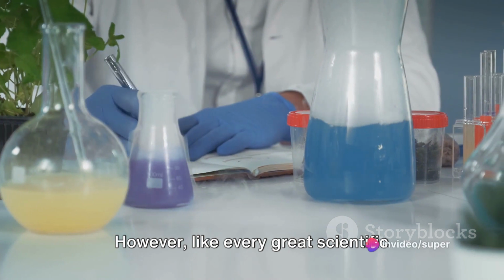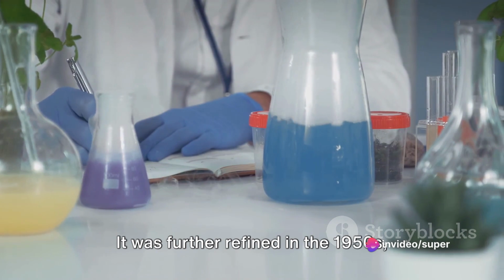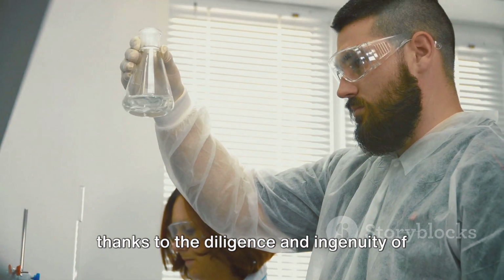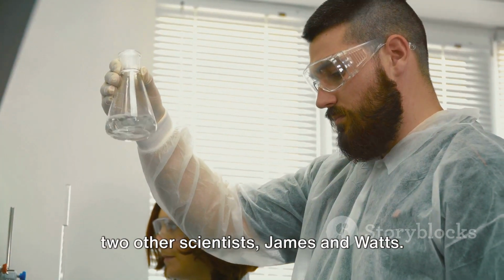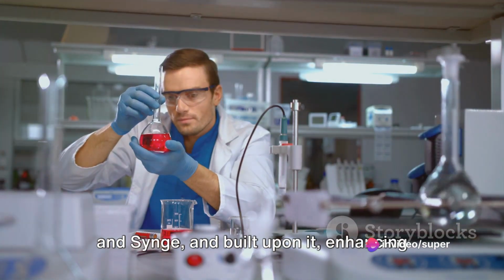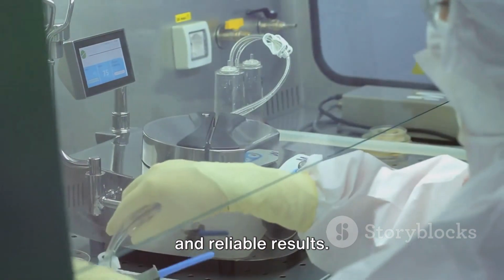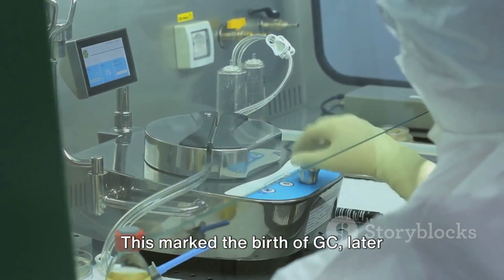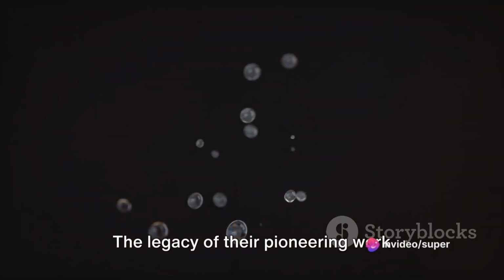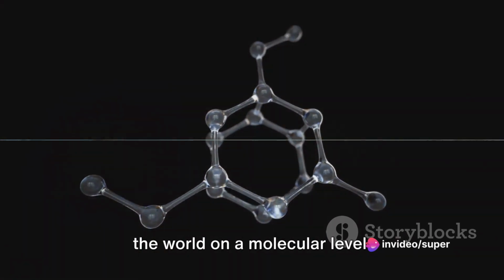However, like every great scientific breakthrough, the development of gas chromatography didn't stop there. It was further refined in the 1950s, thanks to the diligence and ingenuity of two other scientists, James and Watts. They took the foundational work of Martin and Synge and built upon it, enhancing the technique to offer even more precise and reliable results. The legacy of their pioneering work continues to shape our understanding of the world on a molecular level.